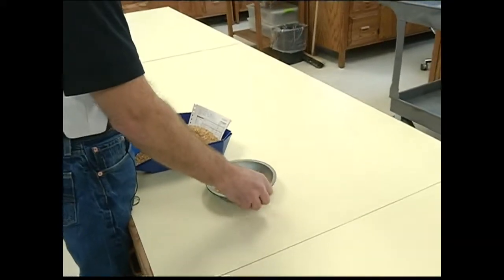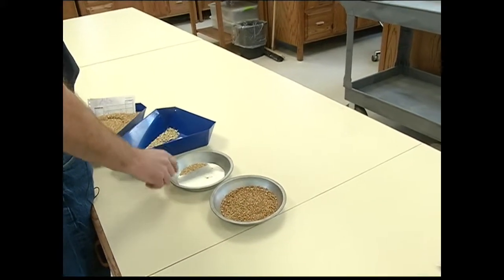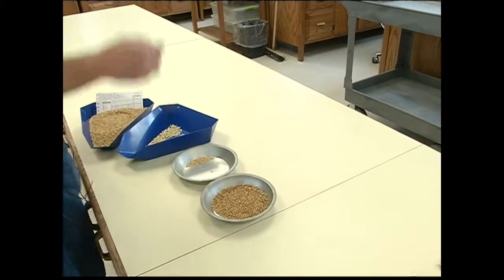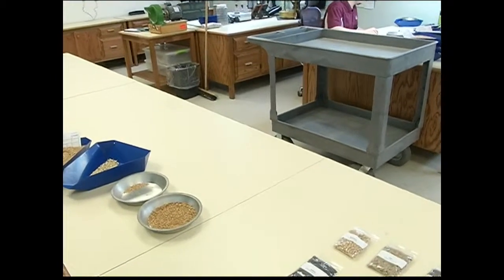In a typical year, the Grain Lab tests about 30,000 samples, mostly wheat and barley, followed by pea and lentil samples. And Remney adds that there are some not so well-known grains that make the state unique. We have standards specifically for niche products that are grown only in Montana, like hulless waxy barley. That's a product that was developed in Montana, grown in Montana. It was developed about 30 years ago at MSU, and that product is now used on the Kashi bar.